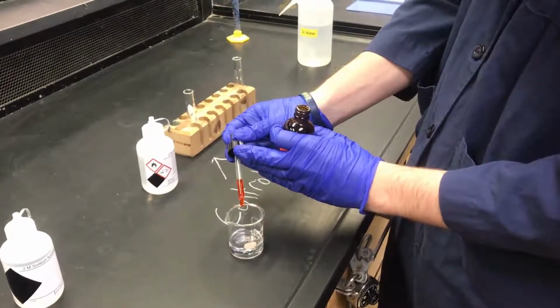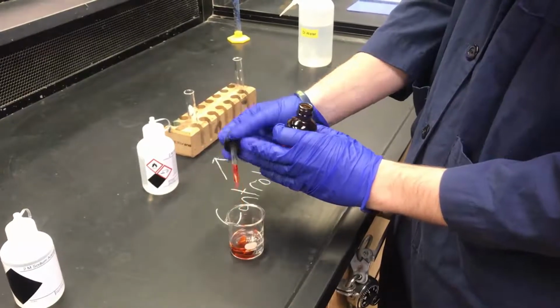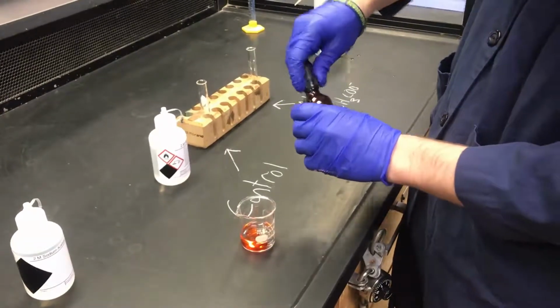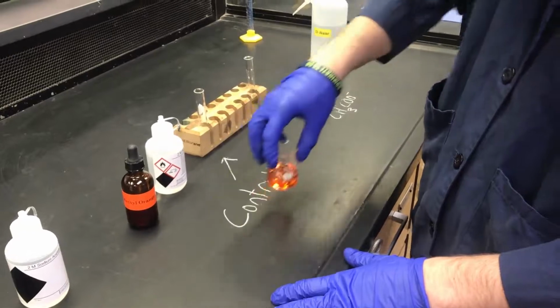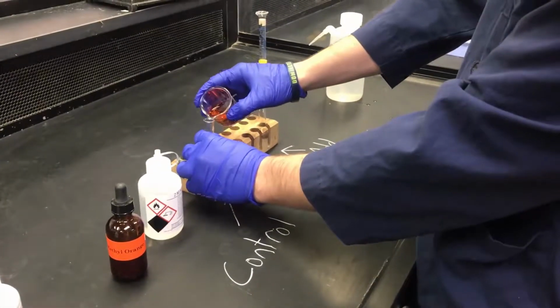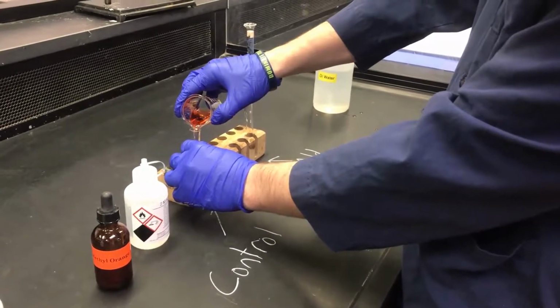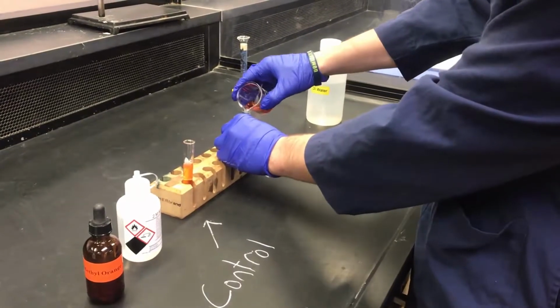And this will be our equilibrium mixture. So you can see the color is pretty orange, which means it's a pH between 4.4 and 3.2. And we're going to split this solution evenly between our two test tubes.